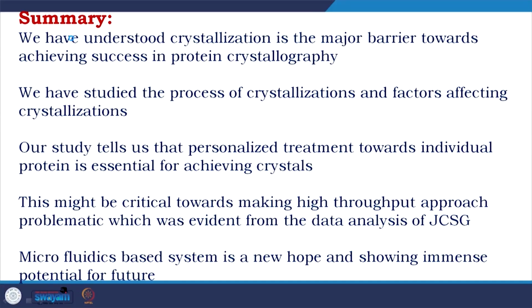And then we looked at microfluidics, the microfluidics based system. It is definitely a new hope, and it is already showing immense potential, and I sincerely hope it would come out as a device and we could all have access to that, because at the end it is not crystallization, it is crystallography to solve the structure and relate it to function. That is the goal. Our goal is to go from sequence to function. That is where structural biology is standing.